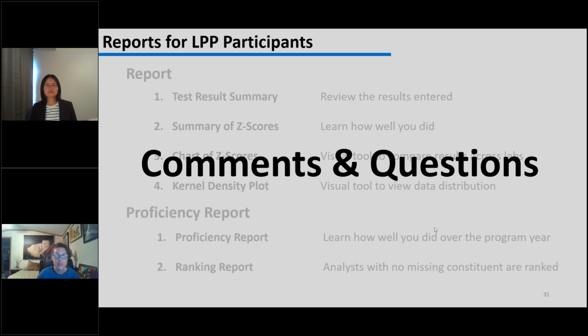Okay, and we have a few more questions now. Will the Q4 of the current proficiency series be used for the calculation of analyst ranking? So right now, our position is the Q4 results will be omitted from the performance measurement of the analyst. So it's not going to be included.